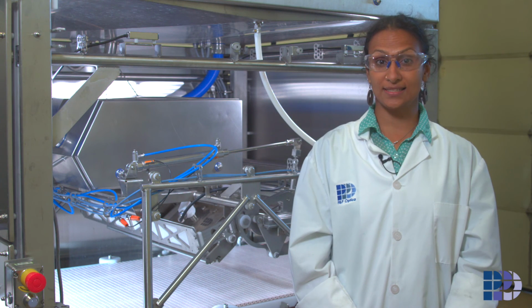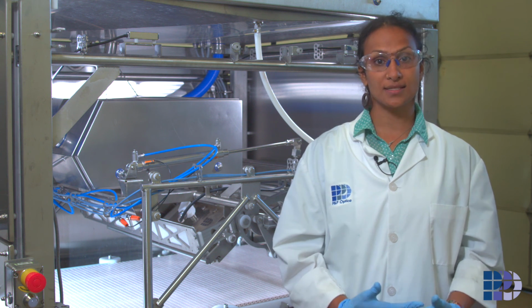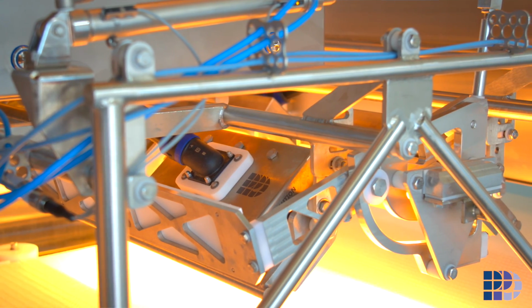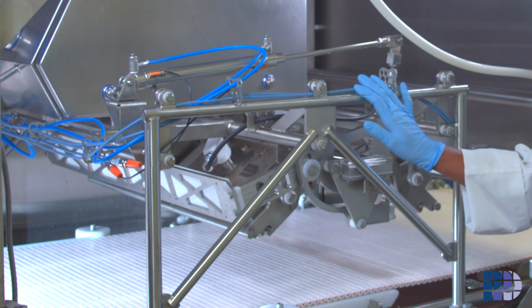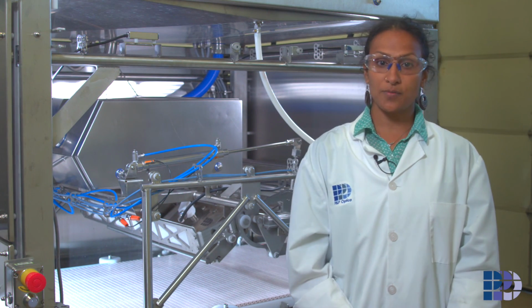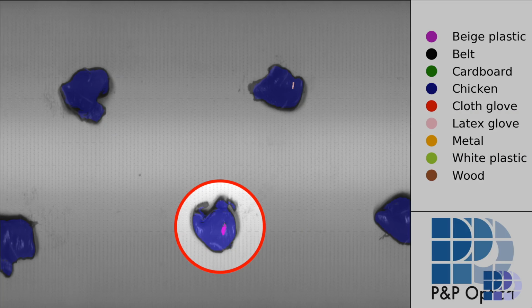We have seen the lights and spectrometers assembled and calibrated. The final step was to put our spectrometer inside our sealed detector module and then mount the lights and detector module onto the frame. Here we are in front of a PPO smart imaging system, where you can see that we have mounted the frame onto the system. The assembled PPO smart imaging system is then tested at our facility for your specific application before being shipped.